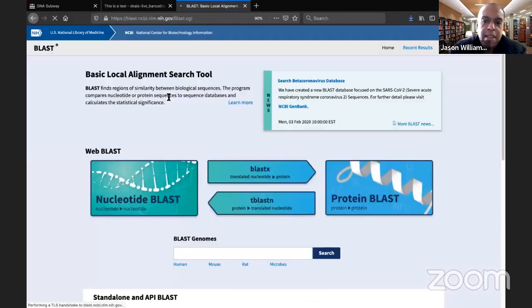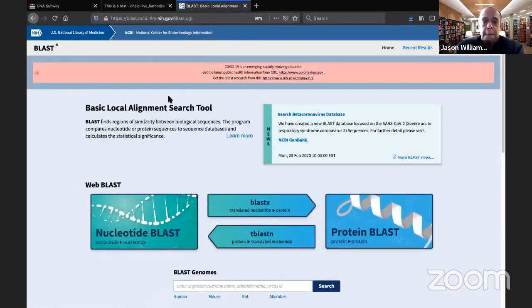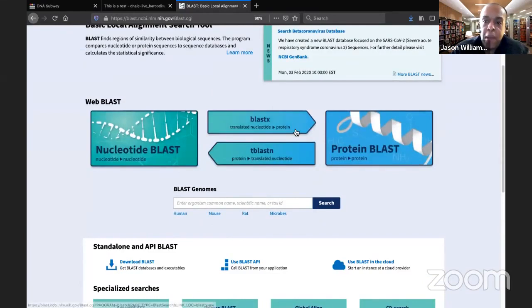Now, the other thing that I don't have time to go into today, and I mentioned a little bit, and I introduced NCBI last time, which is the National Repository at NIH, the National Library of Medicine, actually. It's a national service. So nearly every scientist all over the world deposits their sequence in databases like this. Most of them are mirrored. So there's GenBank in US, and a lot of people use that one. And there's a few other large ones in Europe and also Asia. There are other ways, as I mentioned, BLAST can be used with proteins. It could be used with other things, but we're going to go ahead and select nucleotide BLAST.